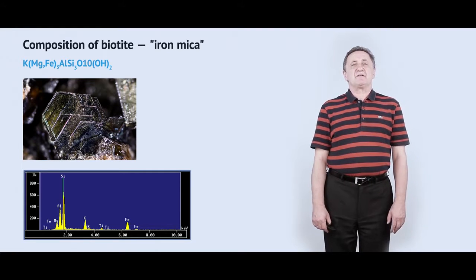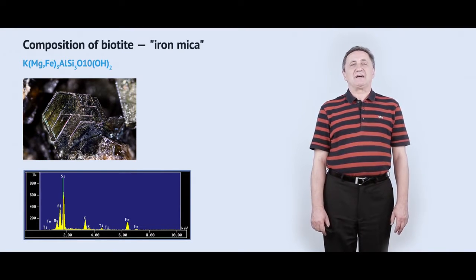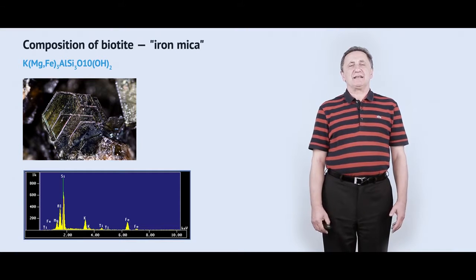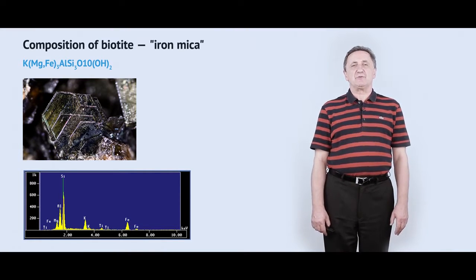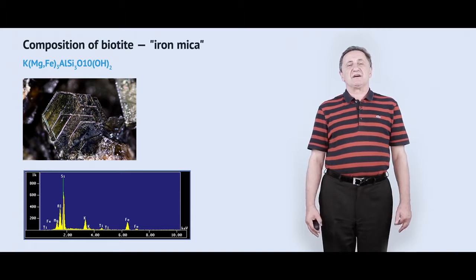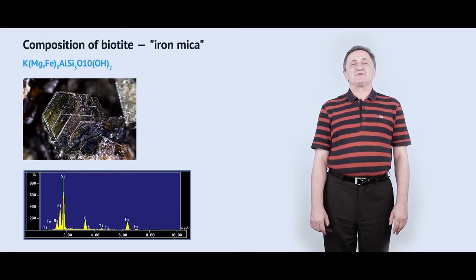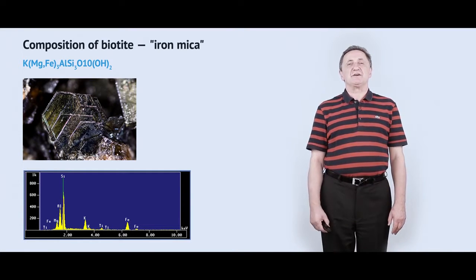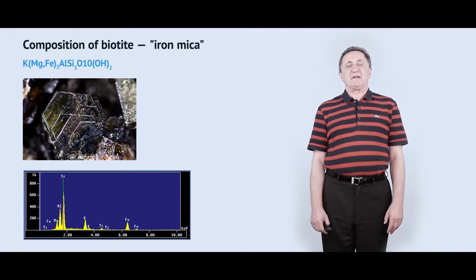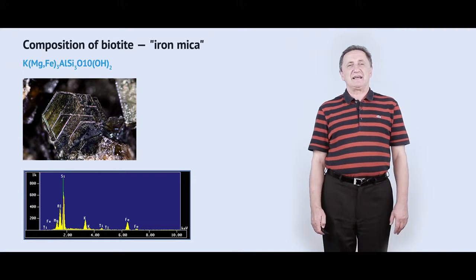You have to remember that EDS analysis doesn't allow us to detect very light elements. Elements such as hydrogen and lithium cannot currently be detected by EDS. The whole analysis starts with boron, with Z equals 5. So if your phase involves some hydrogen, you have to account for this by recalculating the amount of hydrogen, assuming that you should have 100% of total elements in the investigated phase.